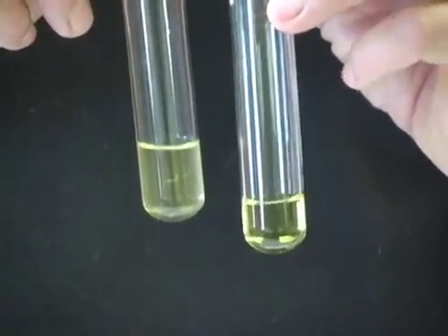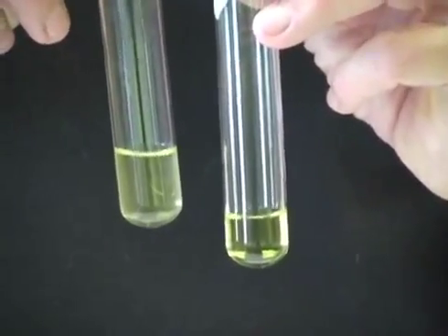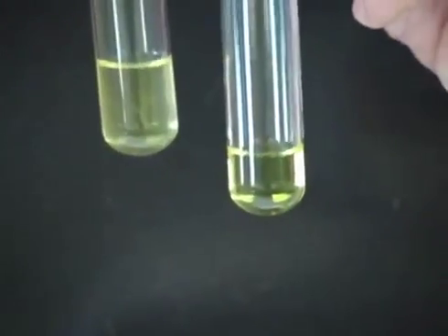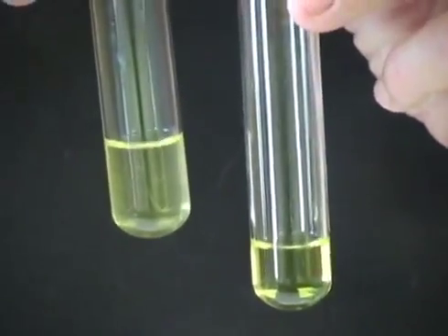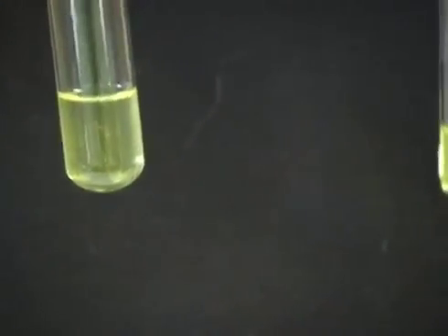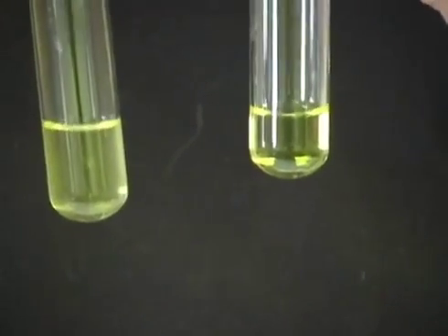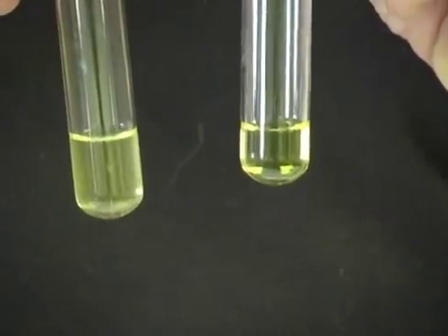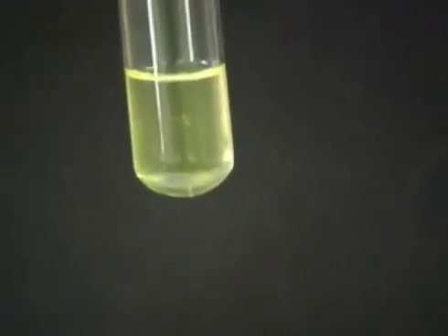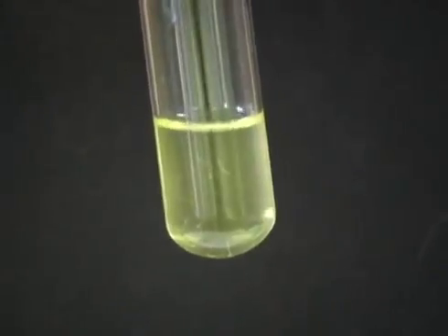One disadvantage of using broth to grow bacteria is our inability to determine whether the culture is pure or not. A pure culture is a culture that contains a single type of microbe. On your right side, we have an uninoculated, sterile broth tube. We can see that it's transparent. It lacks cloudiness or turbidity. On your left is a tube that has microbes growing in it, and we see that it's cloudy or turbid.